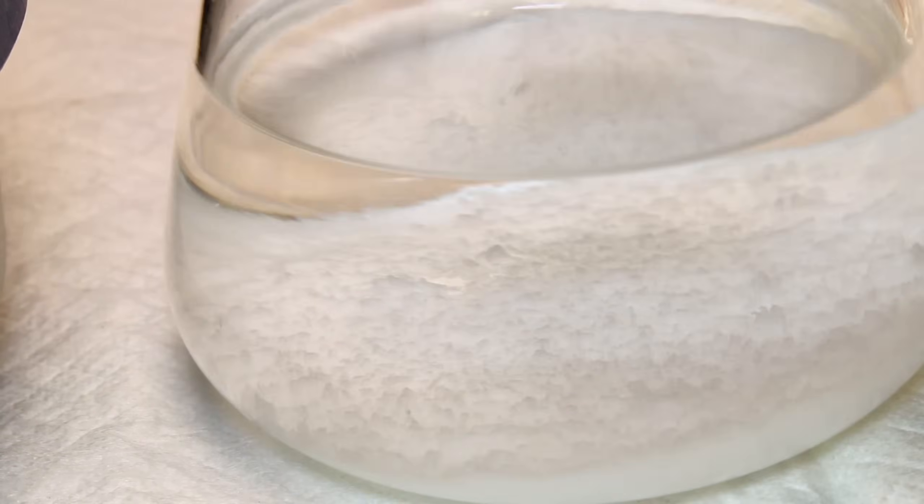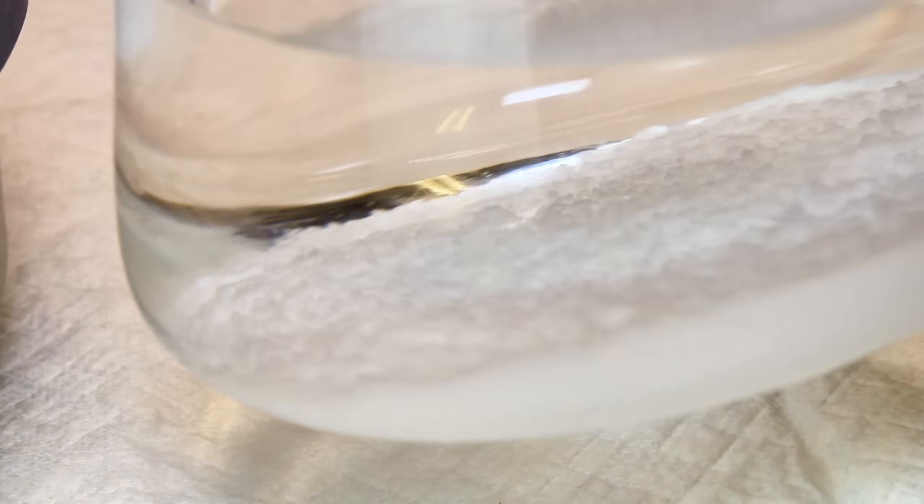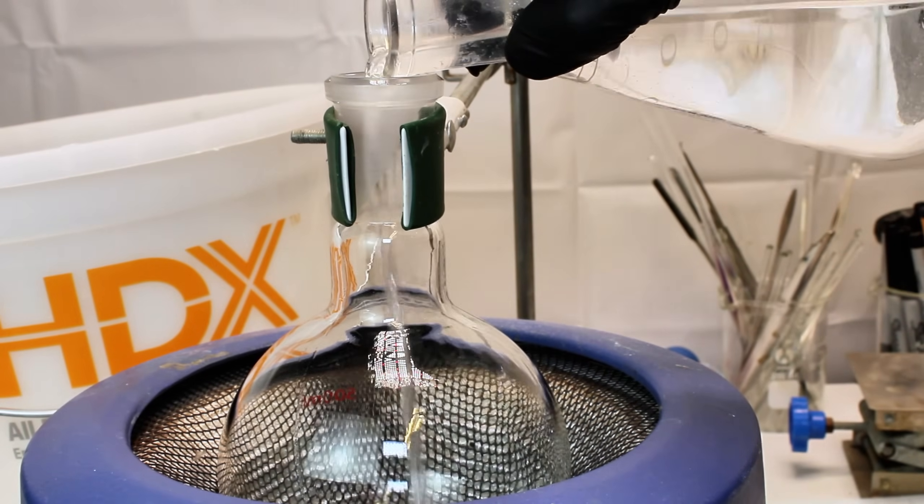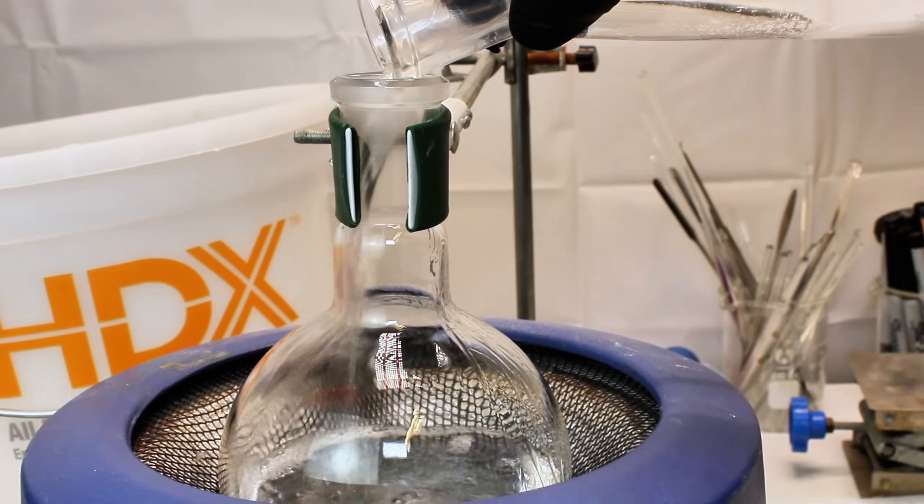I add a few grams of anhydrous magnesium sulfate to remove any water that might have found its way over. After this was allowed to rest overnight, I decanted off my now very dry mixture of ether and alcohol to a new boiling flask and set it up for another distillation.